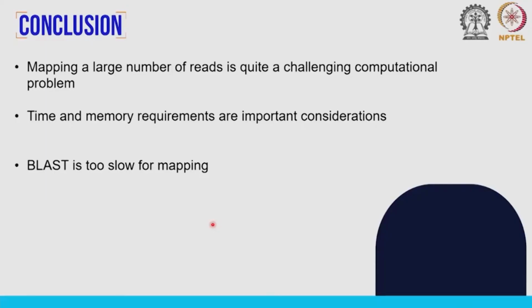What we have also seen is that BLAST is too slow. So, we cannot of course use the brute force approach at all, that will probably take forever. But even BLAST that people used for searching through databases is also too slow for mapping. When you have this large number of reads, when this number approaches billions, this process takes too long.